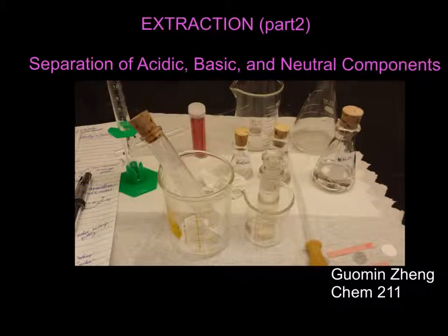Hi, I'm Christine. The experiment I was doing today was to separate acids, bases, and neutral components from my unknown mixture. Using the extraction technique, the acidic and neutral components were found and then separated out from the mixture. In order to identify the two components, the melting point was taken to determine their identity.